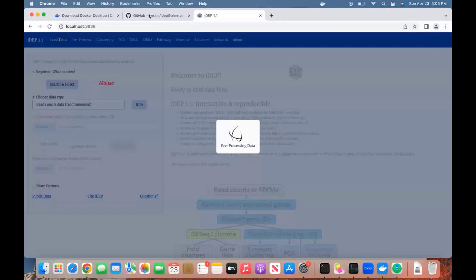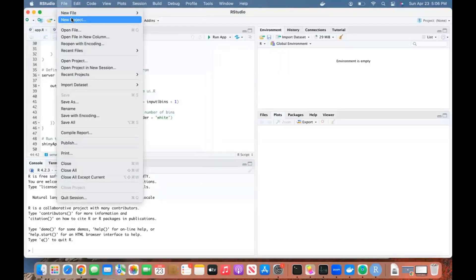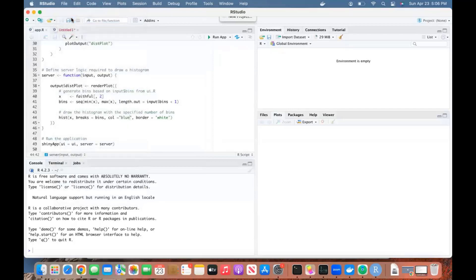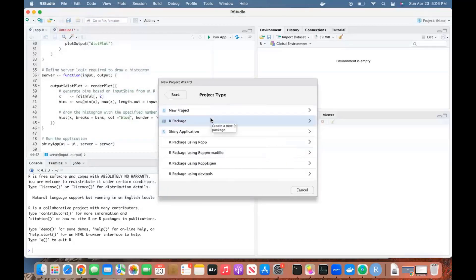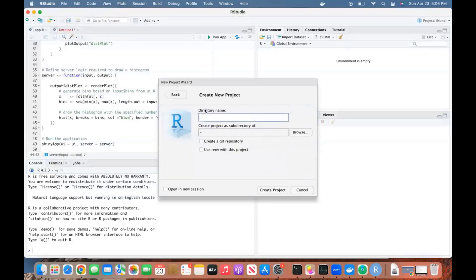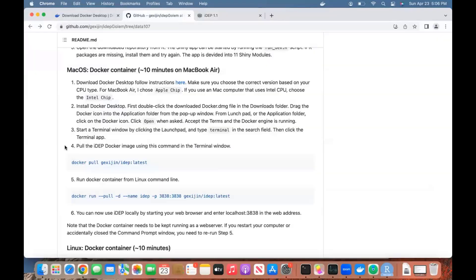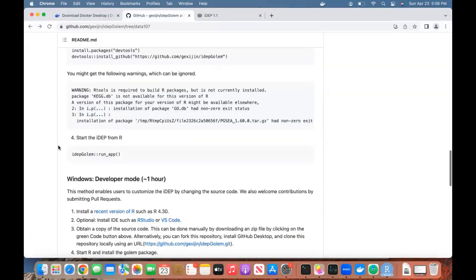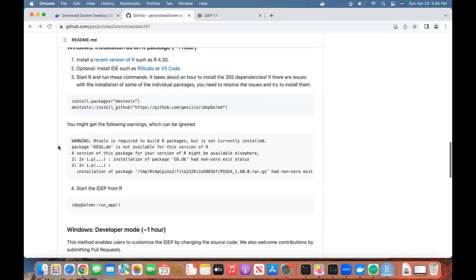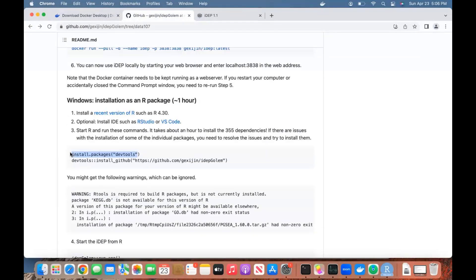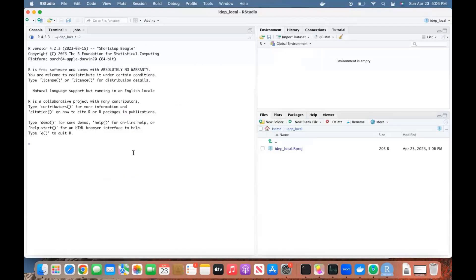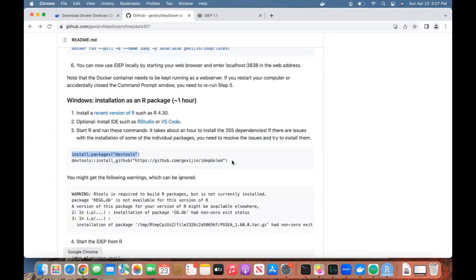Alternatively, from RStudio. Start RStudio, go to File, New Project. I recommend you have a new project for this. Create the project, then install the R package like we do in Windows. Install devtools first. Devtools is now installed.